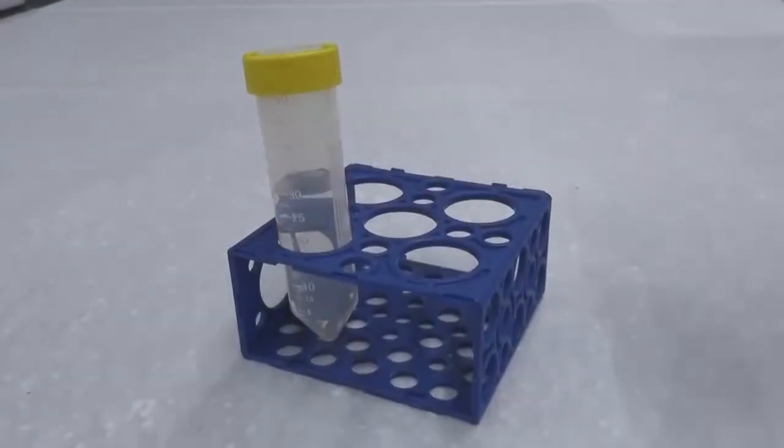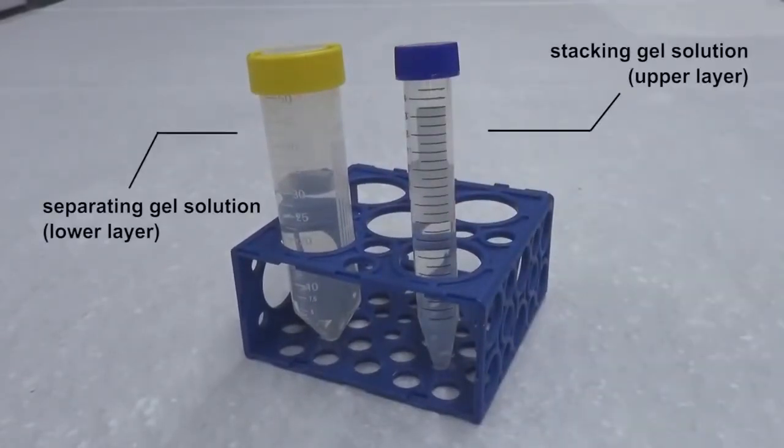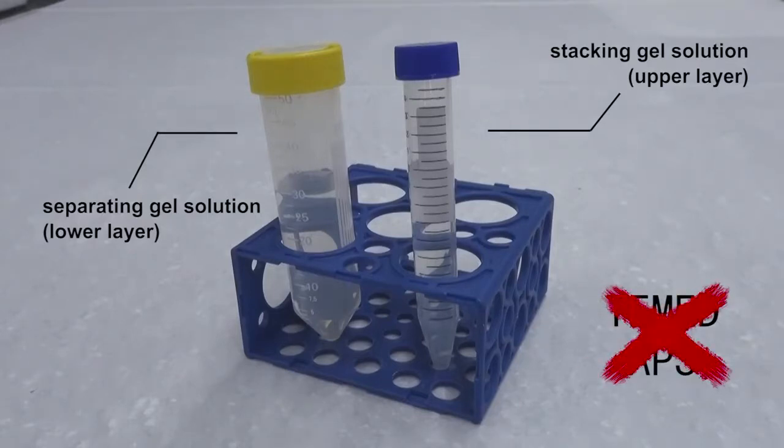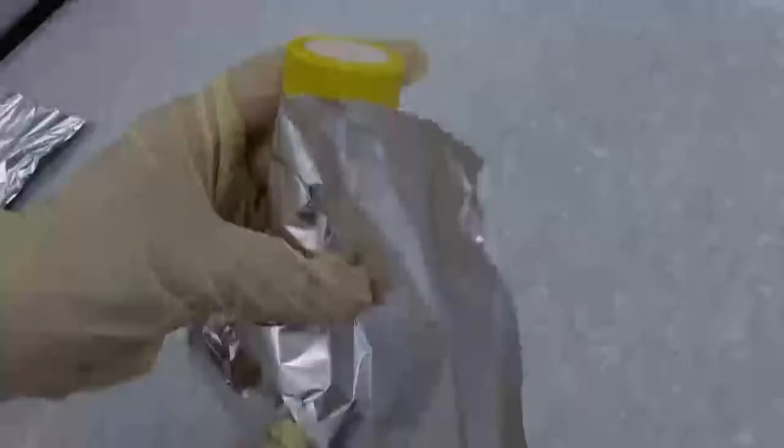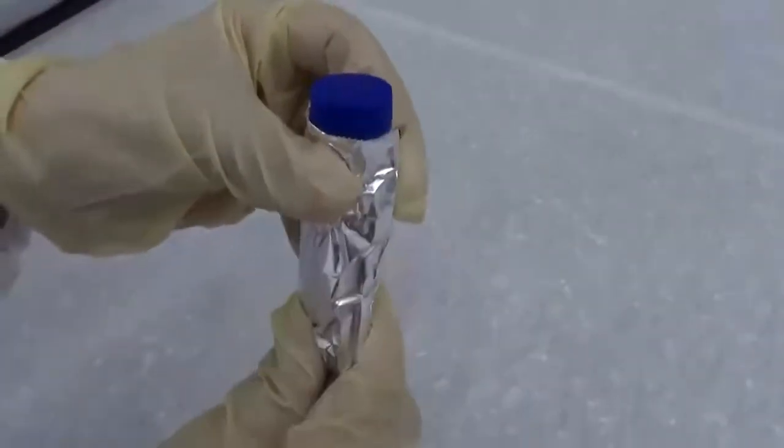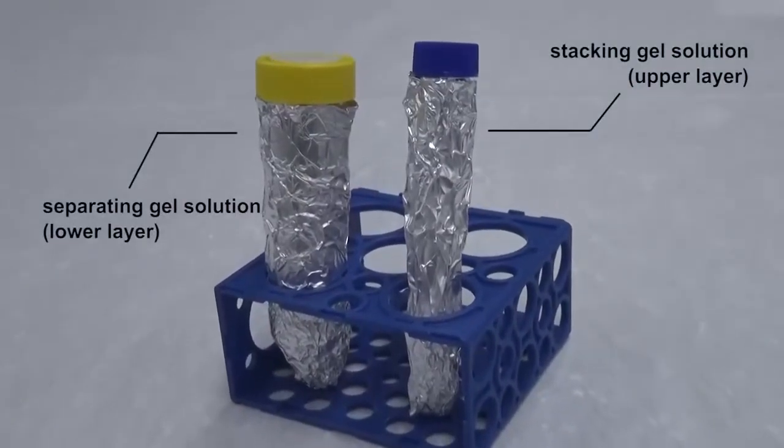Please follow the laboratory instruction to prepare separating gel solution, lower layer, and stacking gel solution, upper layer. Note, do not add the catalyst TEMED and the free radical provider APS at this moment to avoid initiating the reaction prematurely. Cover both gel solutions with aluminum foil to avoid light. Label both tubes. Keep them at room temperature for use.